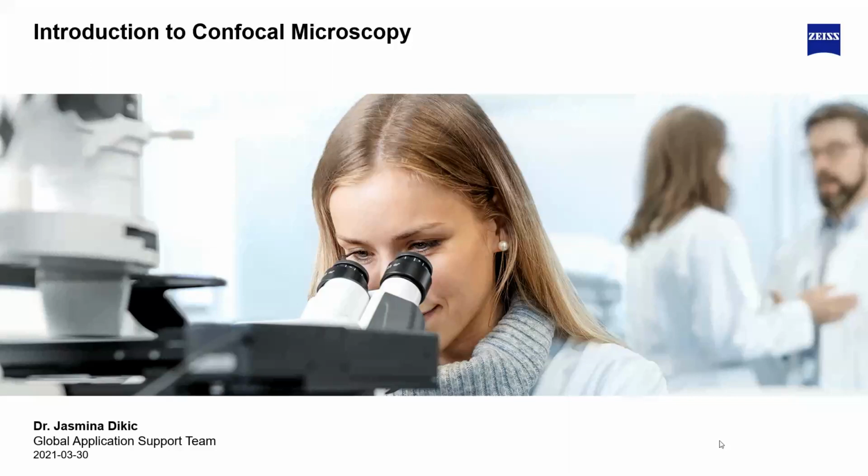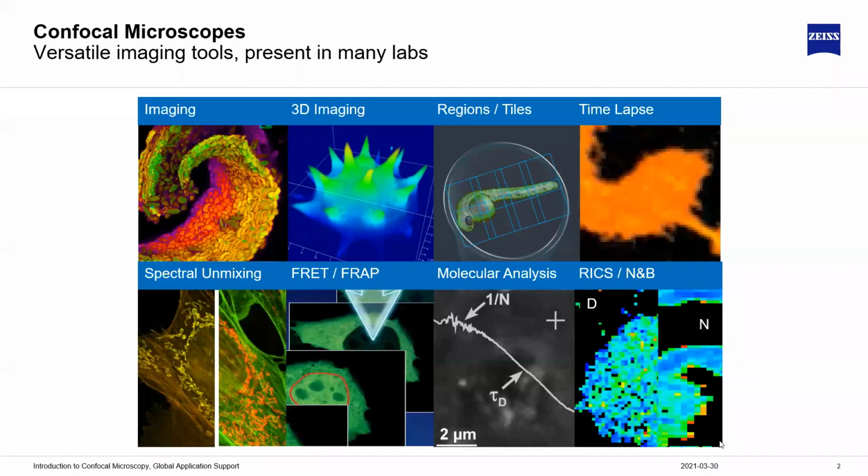Okay, as I said, it will be a short introduction into confocal microscopy. And I'm sure many of you are already using confocal microscopes. So this will be a small refresher of the theory of confocal microscopy. And for those of you who are using more wide field microscopes, this will be a good opportunity to learn something more about confocal microscopes, to learn about the benefits that these microscopes might give you in your day-to-day work.